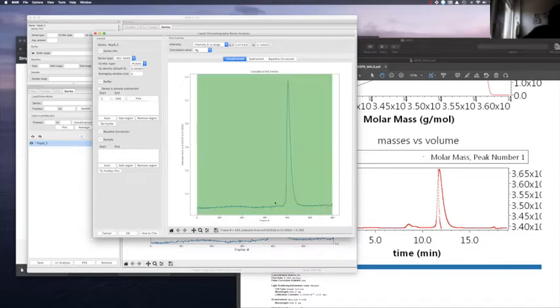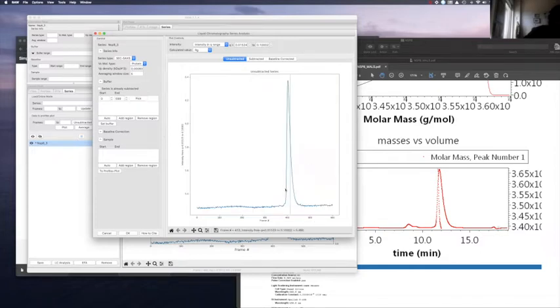Obviously, the buffer in front of the peak is the best selection. The buffer after the peak could be affected by some small molecules at the side. I don't have the problem here. You can see there is no dip or anything; it's a little bit far away, but still, to be sure, just pick the buffer from here to here, set the buffer, and continue.